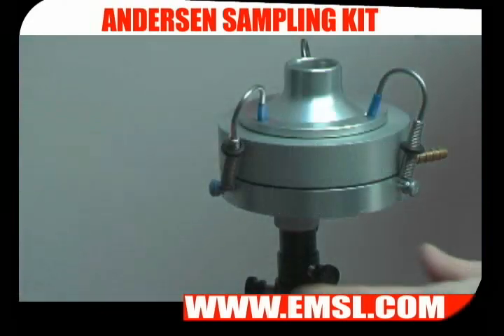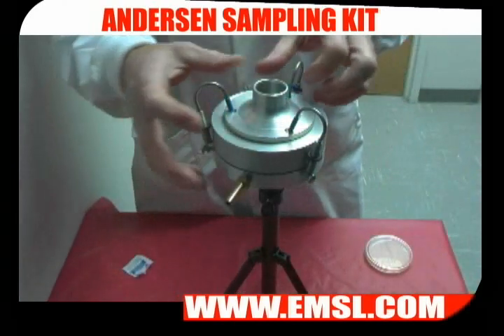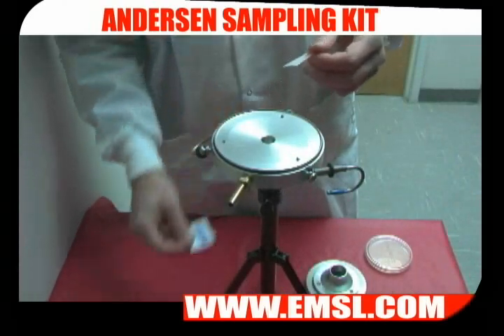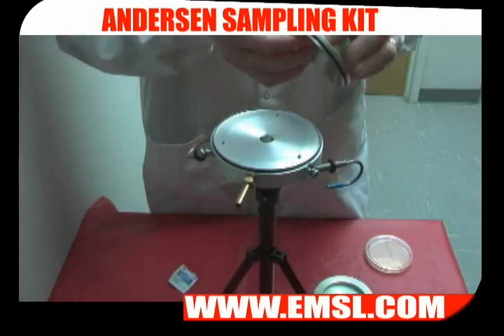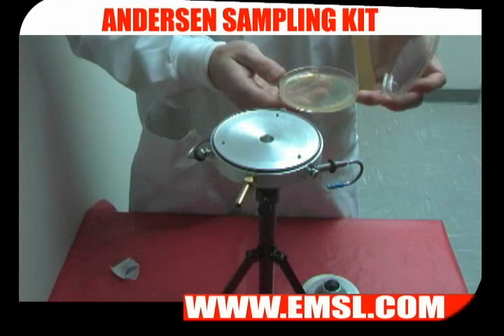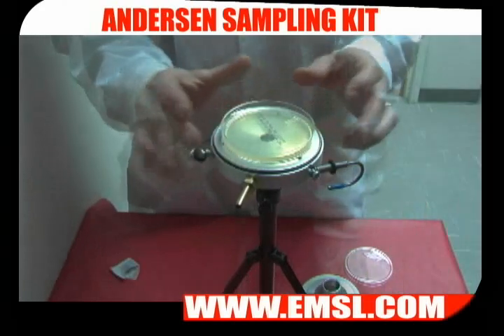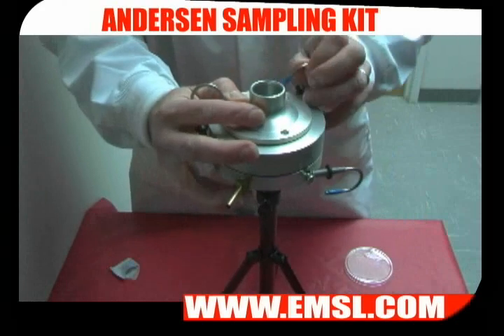Start by attaching your Anderson sampler to your tripod. Disassemble your Anderson impactor. Next, using an alcohol prep pad, wipe down the Anderson unit inside and out. Using an agar plate with the appropriate medium, either for bacteria or for fungi, place it with the lid off on the three pegs. Reassemble your unit with the top and the clips.